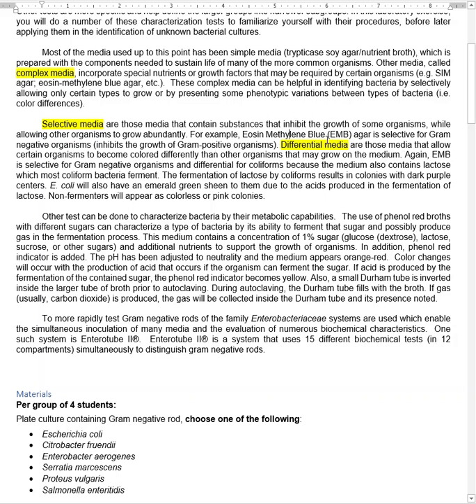So when these guys, the coliforms, Enterobacter aerogenes, E. coli, take that lactose and break it down and use it for food, and they produce a waste product, this is going to cause these colonies of these types of gram negatives to have, they call it nucleated, a little center section that's going to be dark purple.